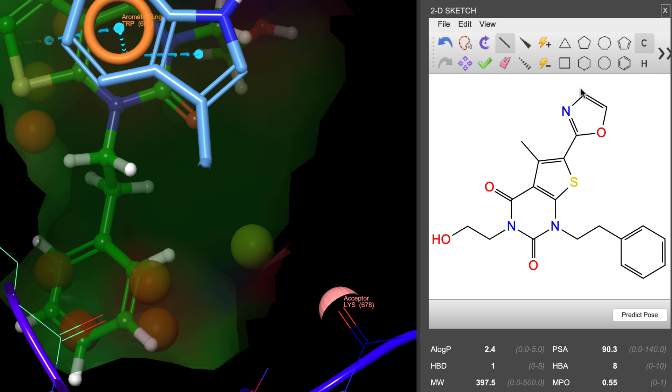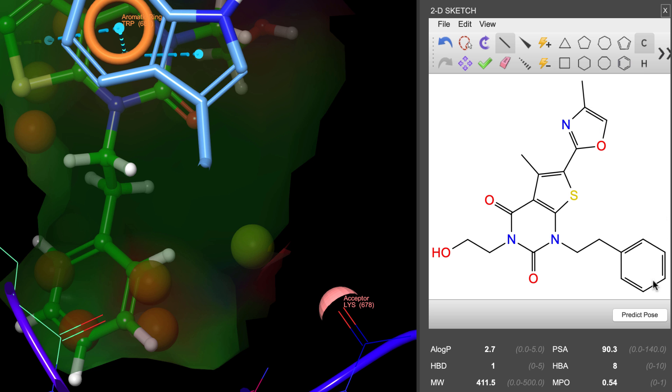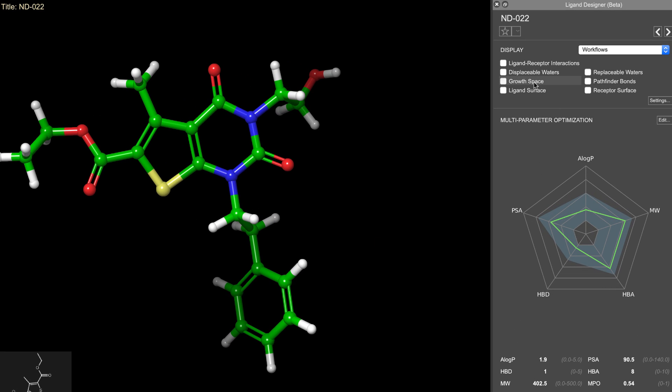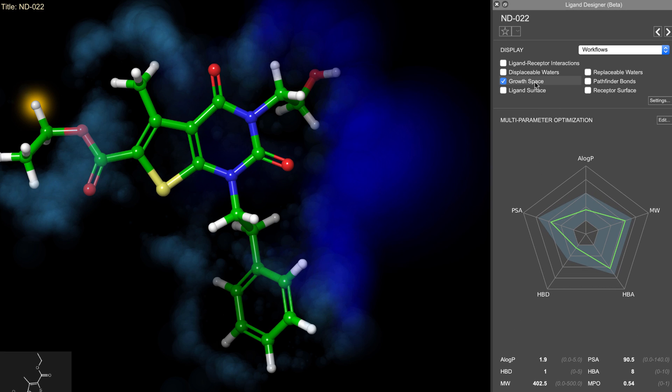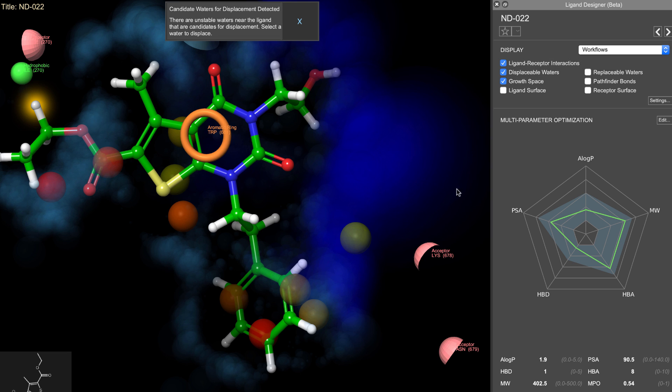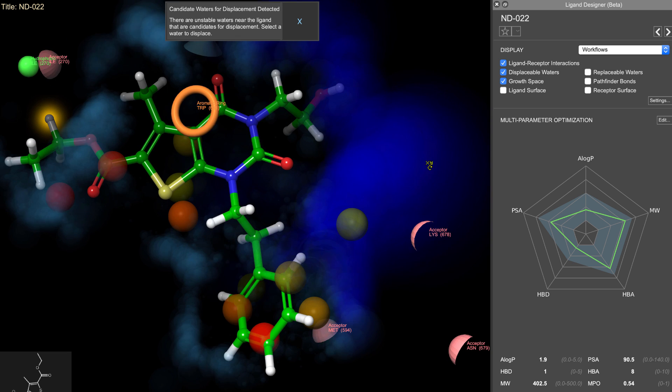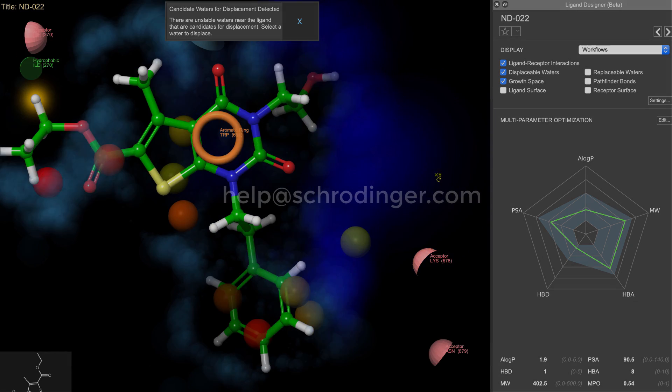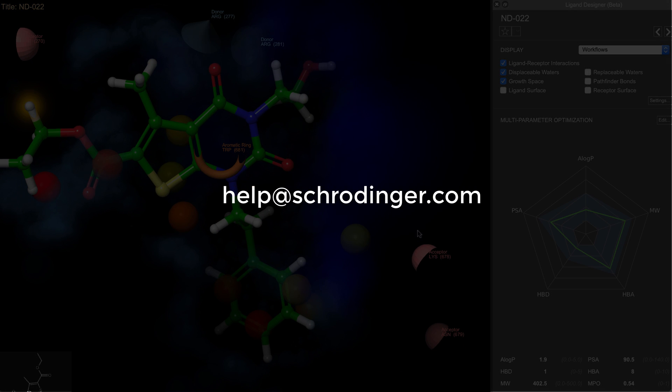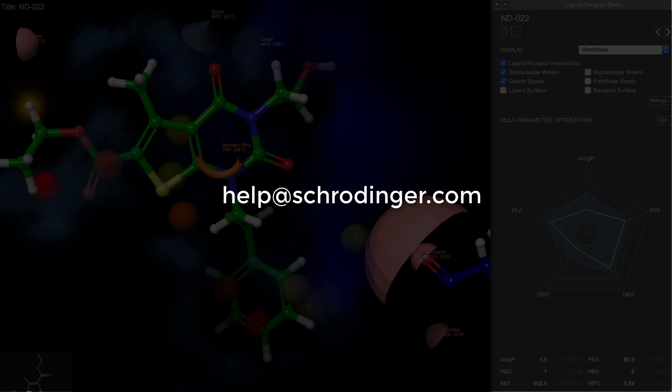Now this is just a brief glimpse of the new ligand designer. It is in beta, so please take the opportunity to give it a test drive. We greatly appreciate your feedback, so feel free to send your notes to help at schrodinger.com.